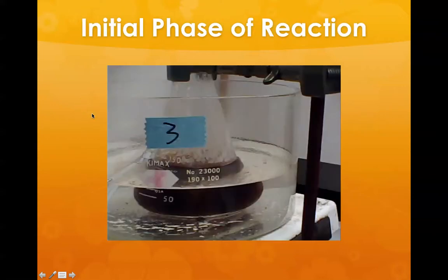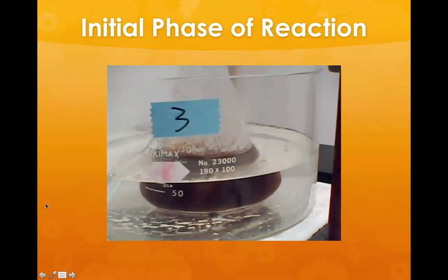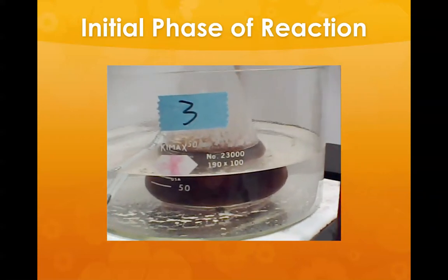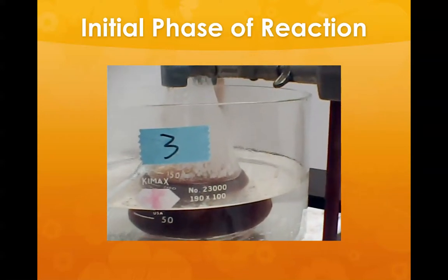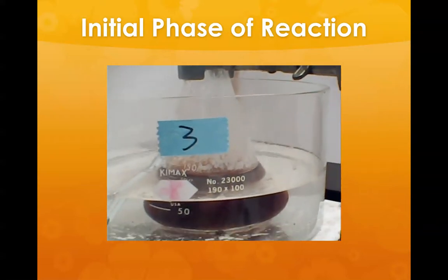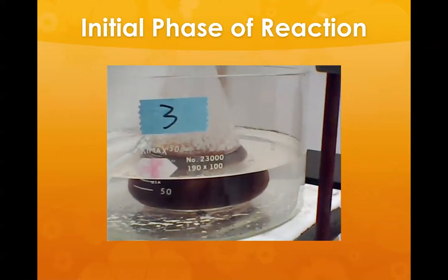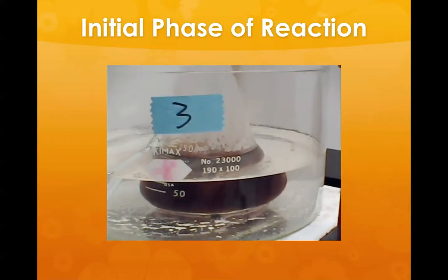In case you're interested in what they look like, here's a short video. At the start, we're at 190 degrees. L-glutamic acid is beginning to dissolve at about 185, 190. And this will give you an idea of what it looks like in the initial stage. We're stirring it, of course, in a silicone oil bath, at around 185, 190 degrees Celsius. That flask contains sulfolane solvent and a certain amount of the amino acid L-glutamic acid.